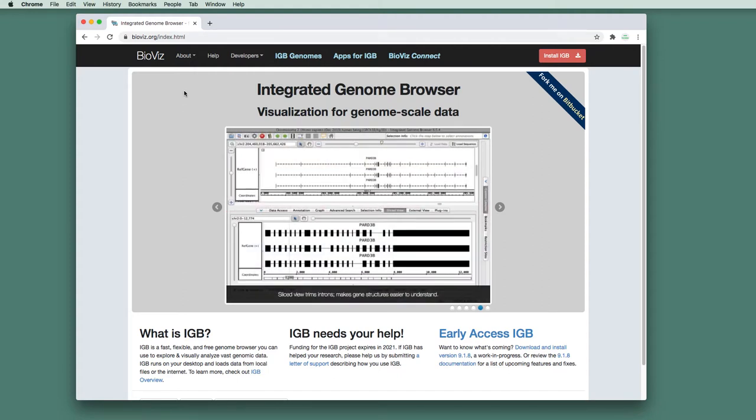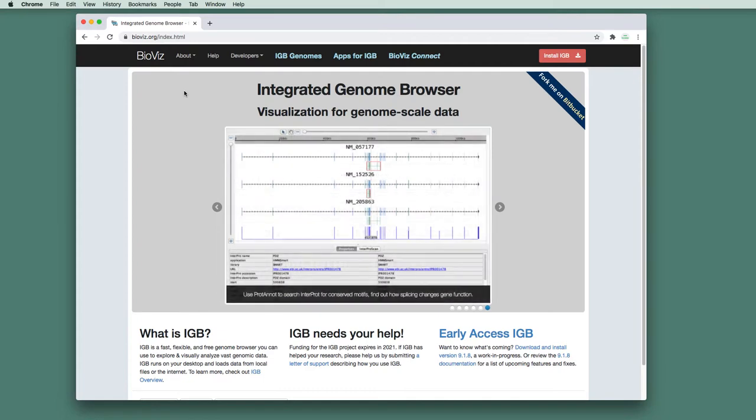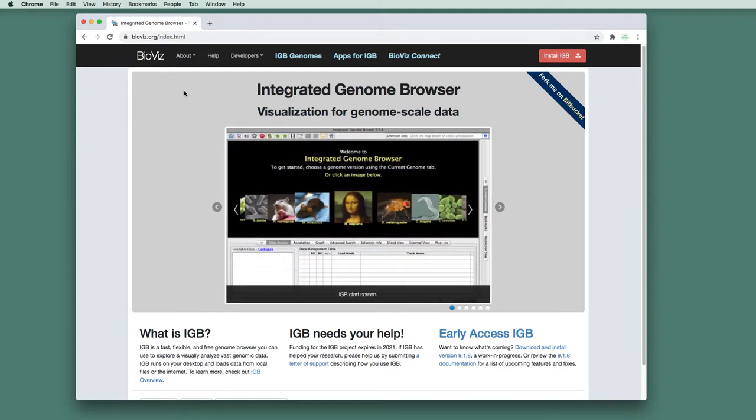Once you do that, IGB will exist as an application on your computer, just like any other application, Microsoft Word or the Chrome web browser. However, like a lot of applications, you can enhance IGB. You can add new features by installing apps for IGB.